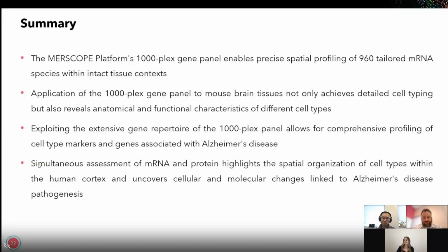Wonderful, thank you. All right, next question asks, can you design a way to identify or mark the region we could apply on the MERSCOPE slide?